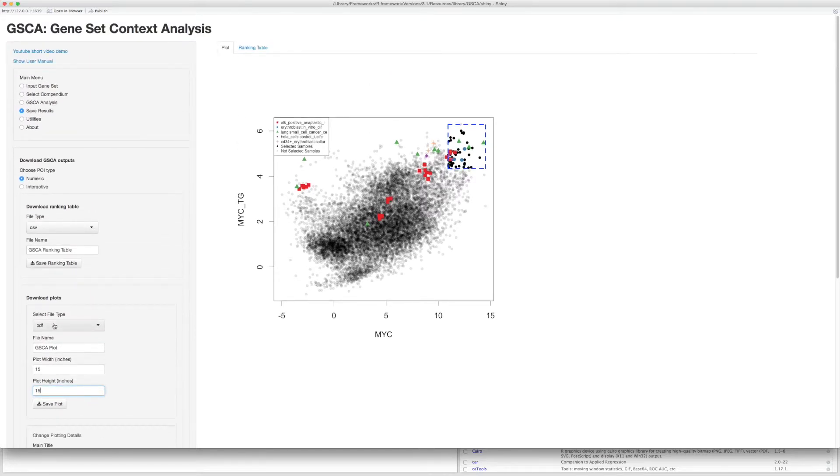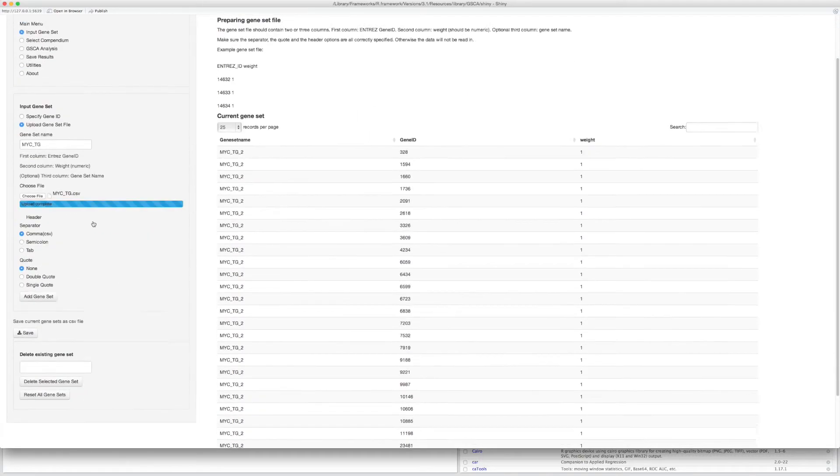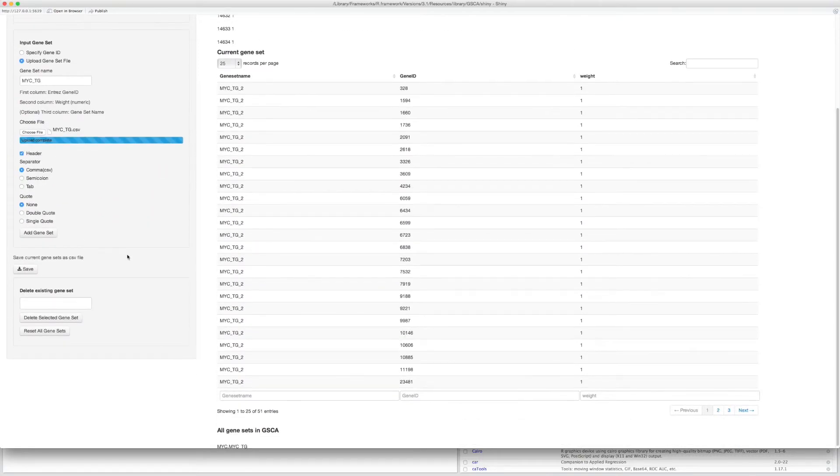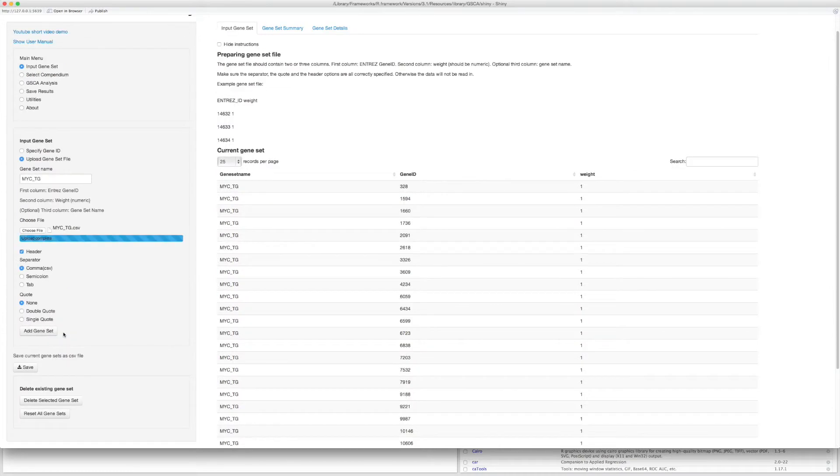OK, now let's quickly go through the second example of three gene sets. Go back to the first step. Click Reset All Gene Sets button to start a brand new analysis.